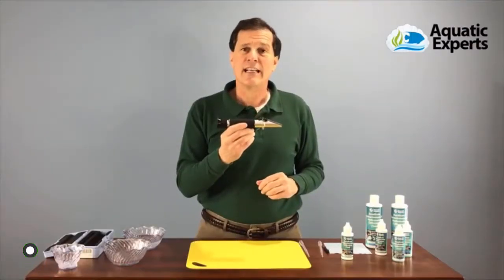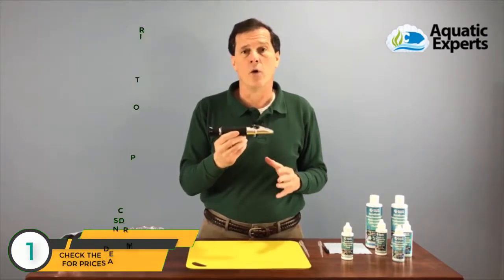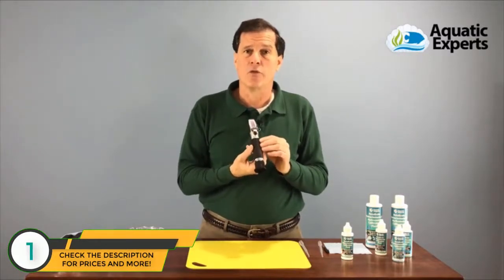A refractometer is an excellent device to measure salinity and specific gravity in your saltwater or reef aquariums, as long as they're calibrated correctly. We're going to go through the steps of calibrating this refractometer — they're pretty much all the same, but go ahead and check your manufacturer's directions to make sure your steps are identical to these.